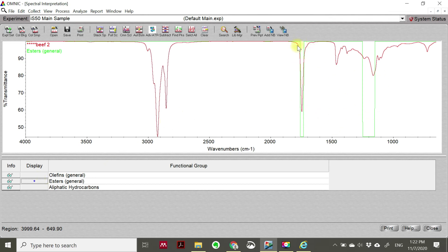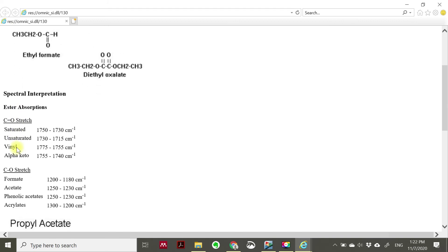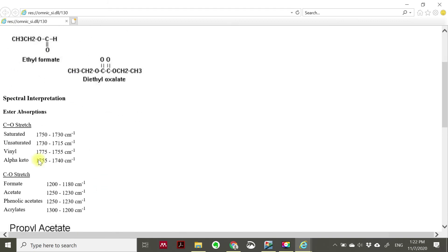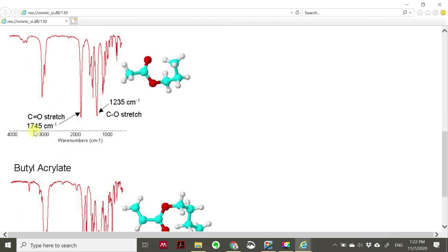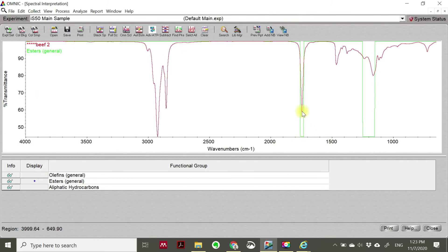I click another one - esters. You will see there is a strong esters group in your sample. You can click 'Info' and it will indicate that esters belong to C=O stretch and C-O stretch in your sample. You can see 1745 and 1235 - there is a C=O stretch at 1745 and 1235 is characterized as C-O stretch. So it's confirmed there are esters as a group in your sample.